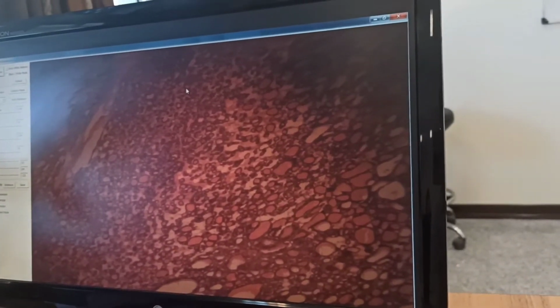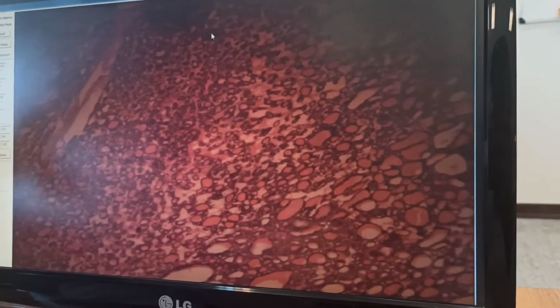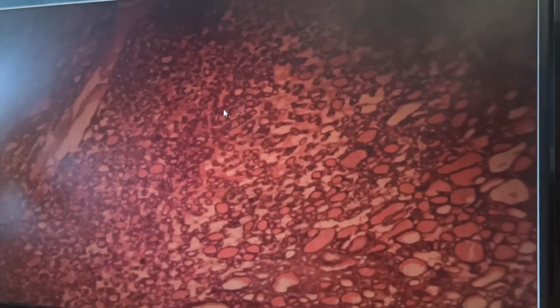We will talk about the endocrine system this session, and we will start with the thyroid gland. Whatever you see in your monitors is the thyroid gland. It is magnification 4, but because of the camera, it looks bigger than what you see in your magnification 4.